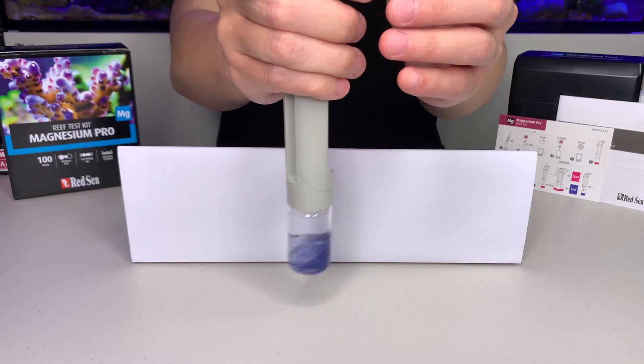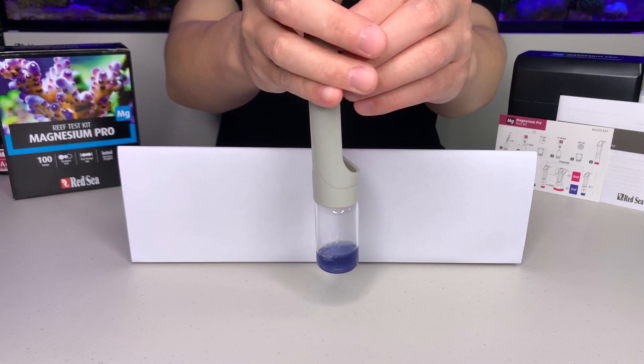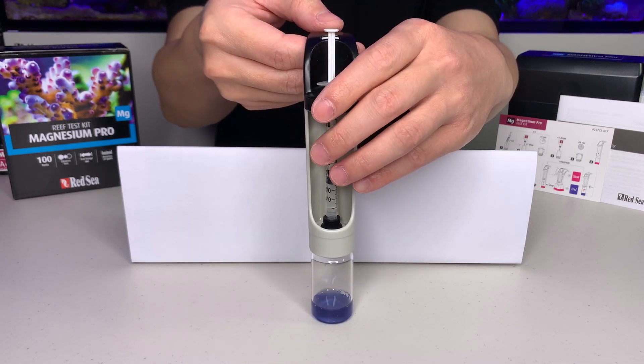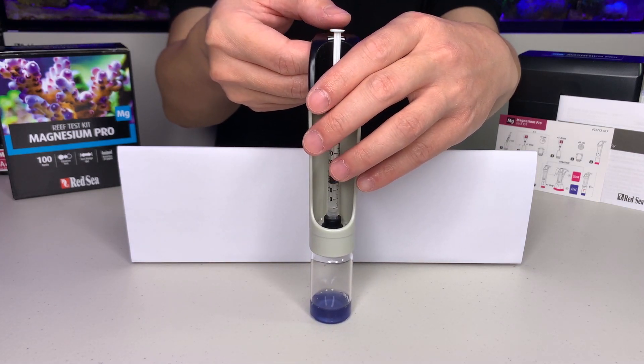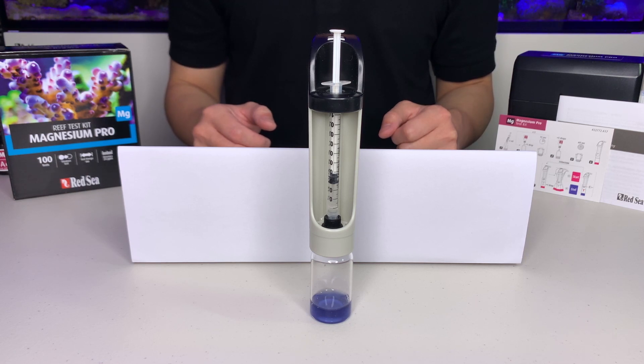Final drop. And we've got our blue here. Please note, shortly after the blue end color is achieved, the liquid in the vial will turn from blue to violet. Do not continue adding the titrant. For best results, the titrant part of this test should not take more than 90 seconds.